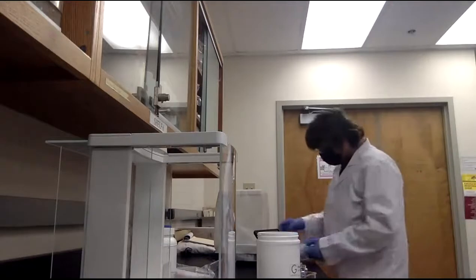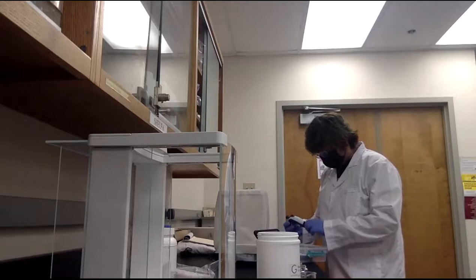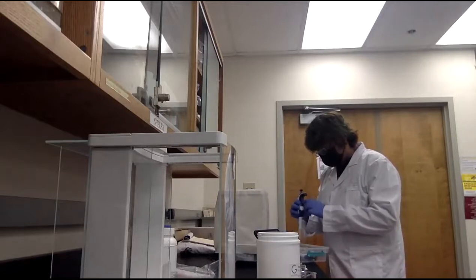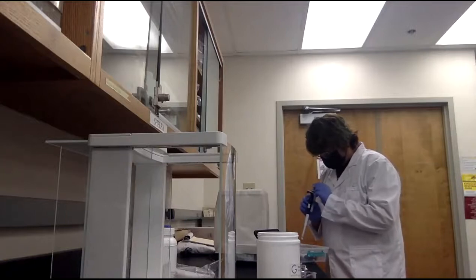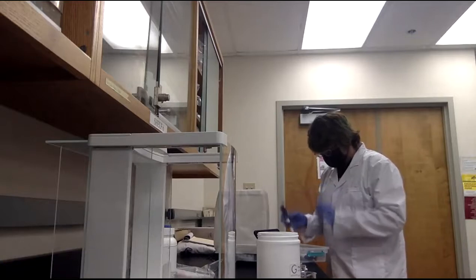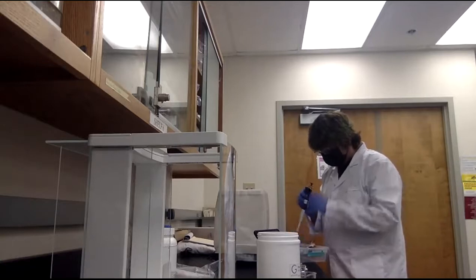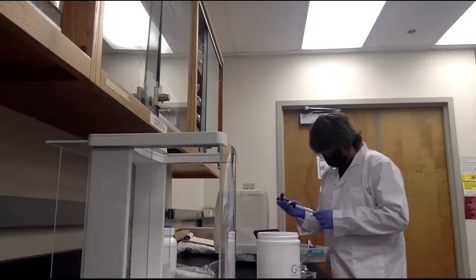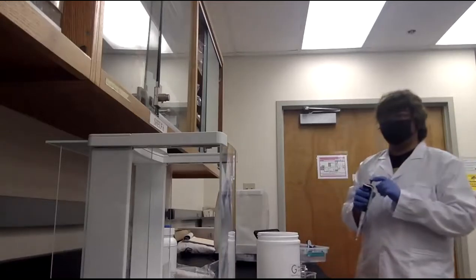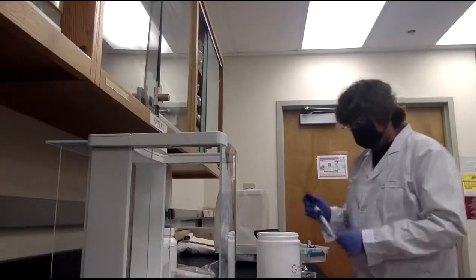Milliliters. Yes. So first the question, which pipette are you using? 100 to 1,000 microliters. That's not what we want. Well, you need to use that because this is the biggest one. You just pipette 3 times. 3 times? Yeah. Oh, yeah, right. 1,000 microliters, it's 1 milliliter. Yeah, right. So my brain got focused on that.